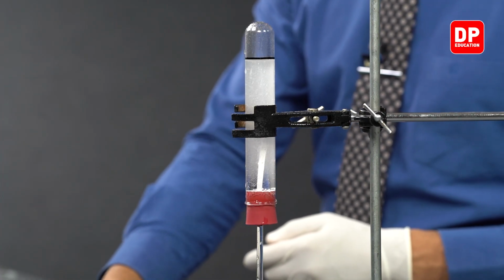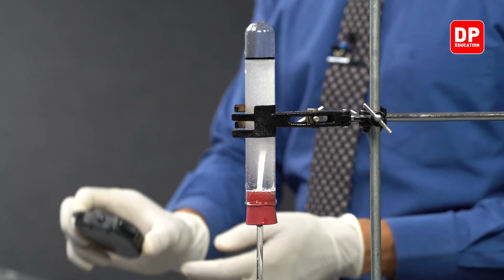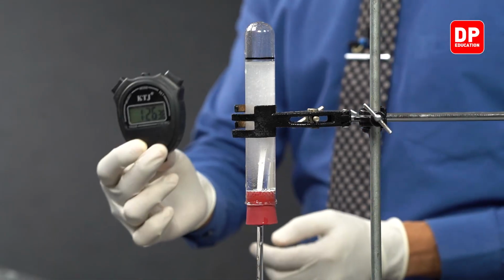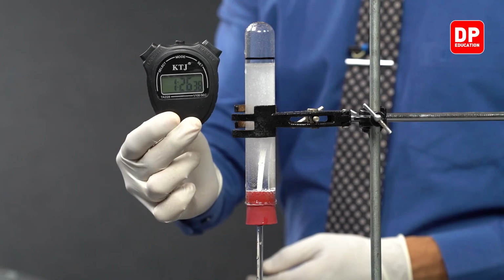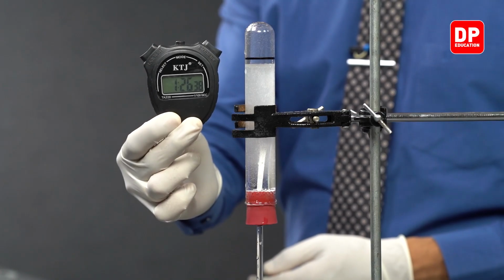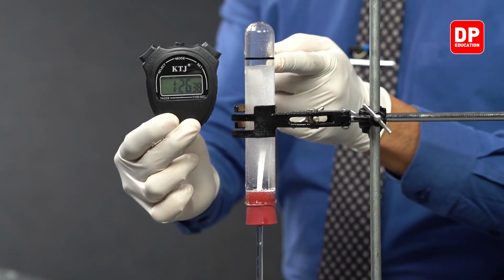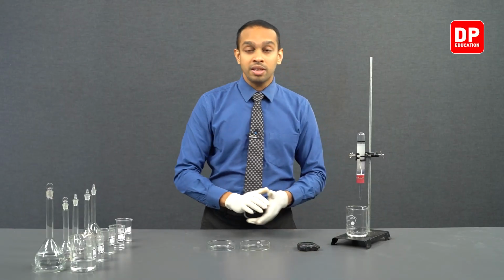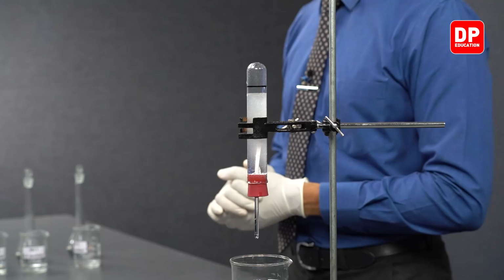Now we have stopped the stopwatch, and the time reading is 1 minute and 26 seconds. So the time that it took for hydrogen gas to get collected all the way up to this black line that we have made on the boiling tube is 1 minute and 26 seconds.